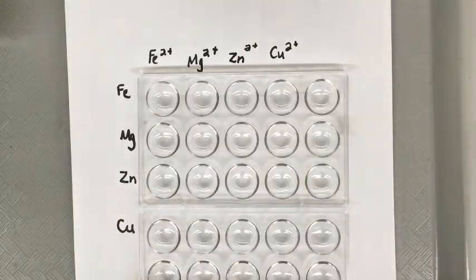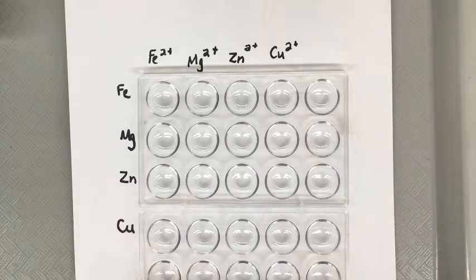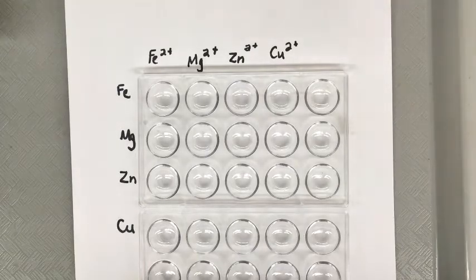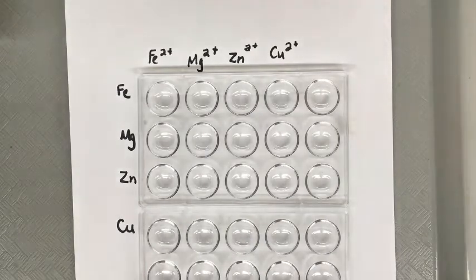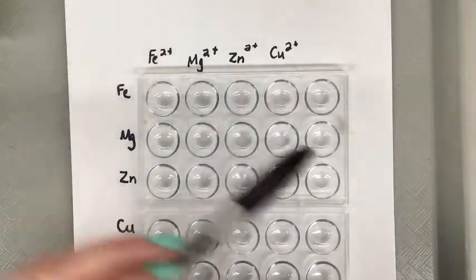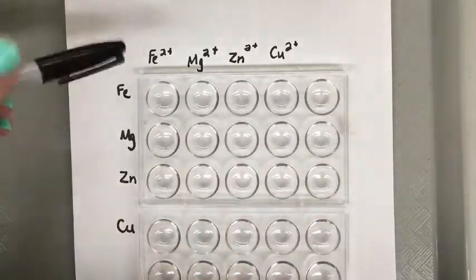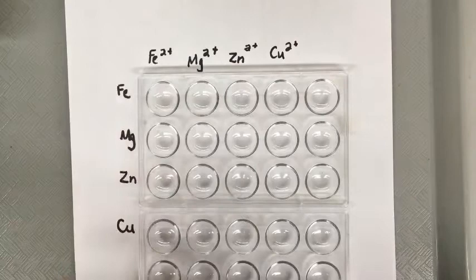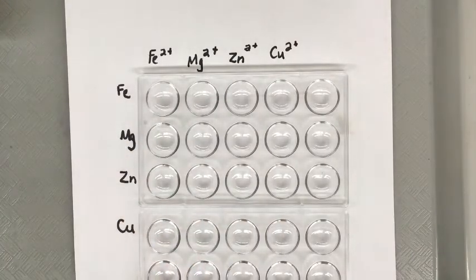The way you would test ions for their reactivity is you would react them with other solutions and also with the same metal ions. So if you take a look here, across the rows I'll put samples of each of those metals and then down the columns I'll put solutions that contain those ions and then we'll see which ones will have a reaction.